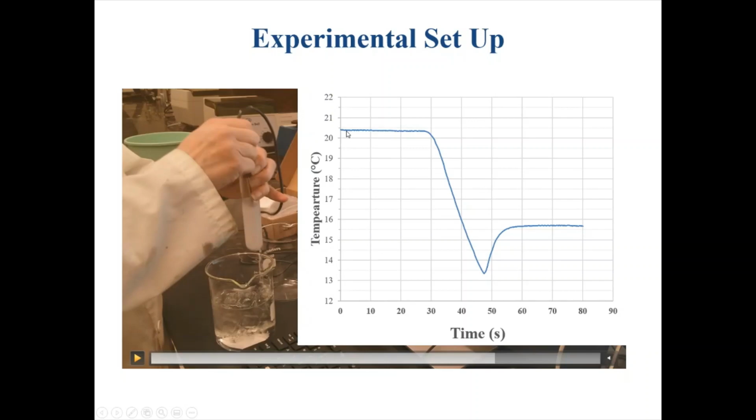So we started with a room temperature sample. We cooled it down. The moment we reached the bottom of this, it turned white. You saw that. And then it snaps up quickly and goes flat, and we get our temperature.